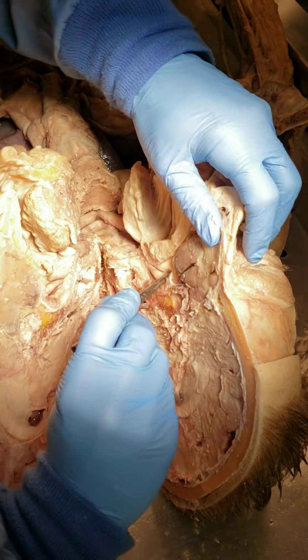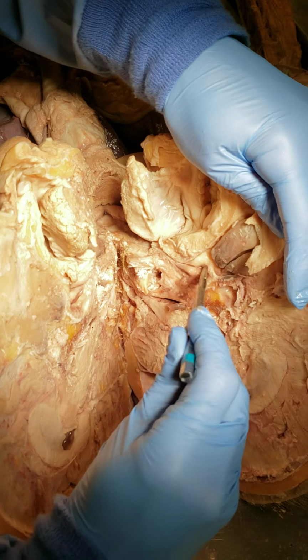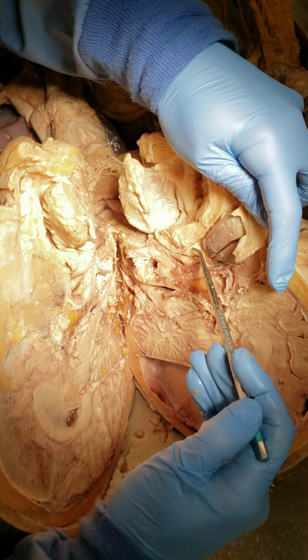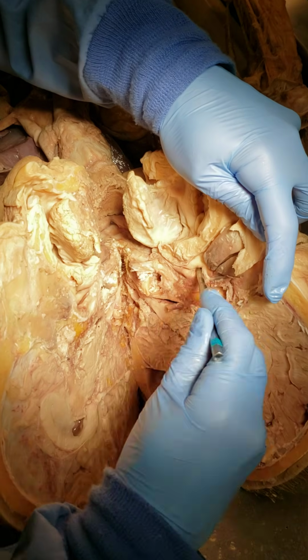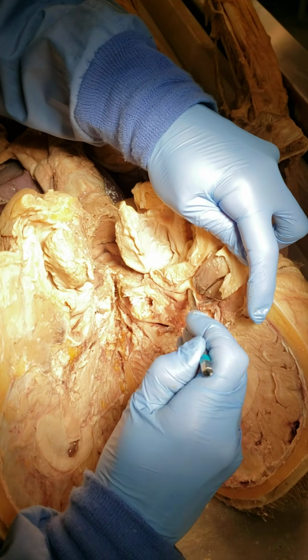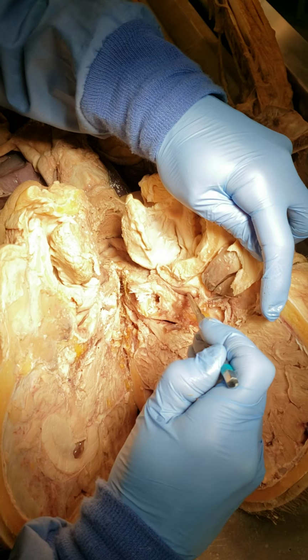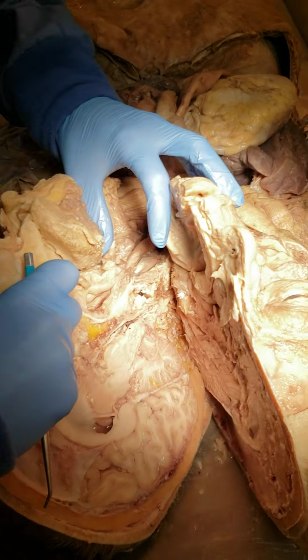So can you see, as I've inserted the probe in the eustachian tube, that is where essentially the ear would drain into the pharynx or the throat. And again, this region right here would be my nasopharynx. So here's my nasopharynx where the eustachian tube is. And again, the pillow-like feature protecting, let's say, particulate matter from entering into the eustachian tube, this is called the torus tubarius.